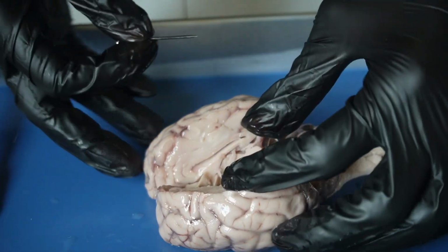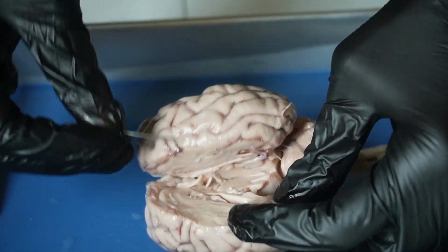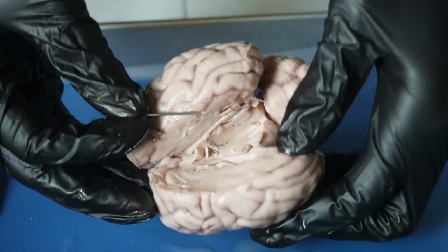And then the next brain structure would be the hippocampus.